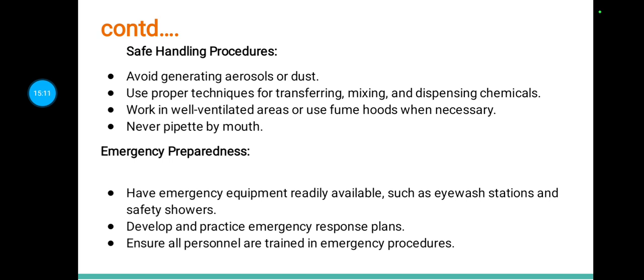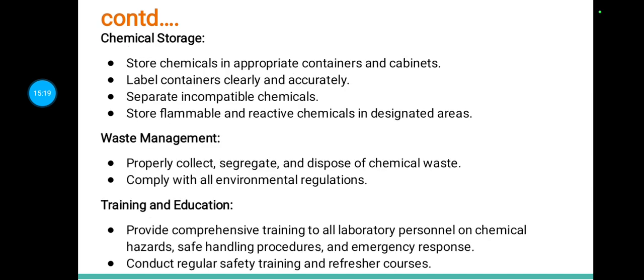Emergency preparedness. Have emergency equipment readily available such as eye wash stations and safety showers. Develop and practice emergency response plans. Ensure all personnel are trained in emergency procedures. Chemical storage. Store chemicals in appropriate containers and cabinets. Label containers clearly and accurately. Separate incompatible chemicals. Store flammable and reactive chemicals in designated areas.